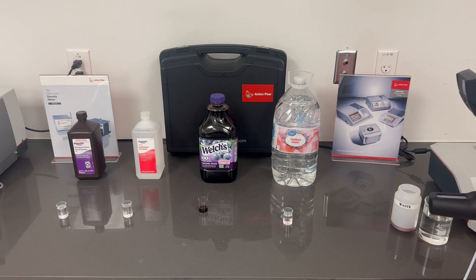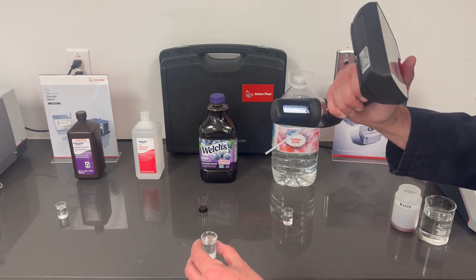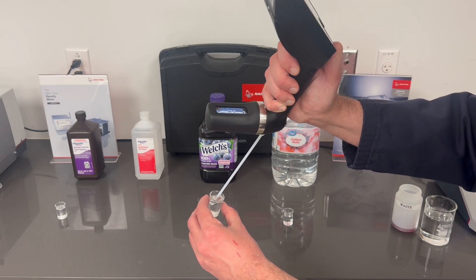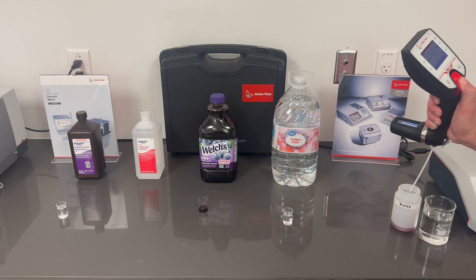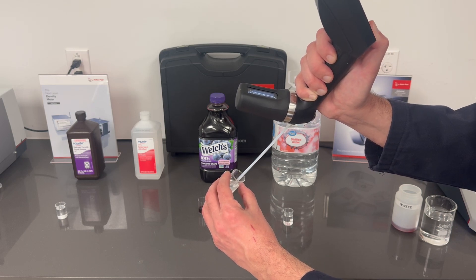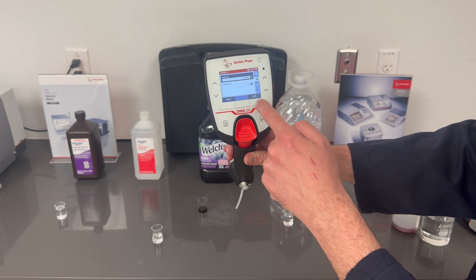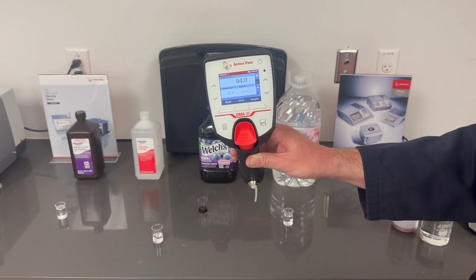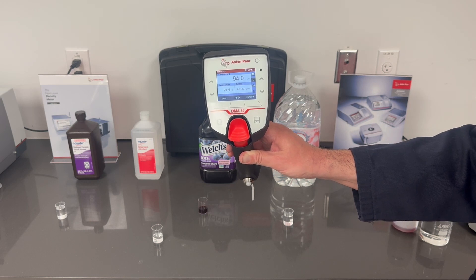Now let's move on to our IPA, our isopropyl alcohol. Same thing — I'm going to do two draws of the sample to make sure my cell is clear of anything that was previously in it. We'll go ahead and switch our method to ethanol. The DMA is saying 94%. The bottle says 91% — looks like they're off a little bit.